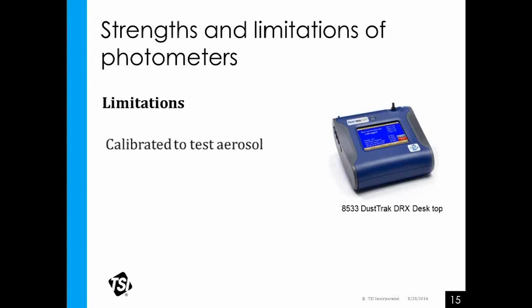So it's very precise, again, to the aerosol it's been tested to. It's accurate to that level. It's not going to work as a standalone reference method unless you verify the aerosol concentrations and do the gravimetric comparison to get those back. If the aerosol changes during your sampling time frame, then your readings are still precise to the aerosol level, but the mass may be different than what you read gravimetrically because of different density, different size, different changes in the aerosol. Humidity can have an effect on photometric measurements.